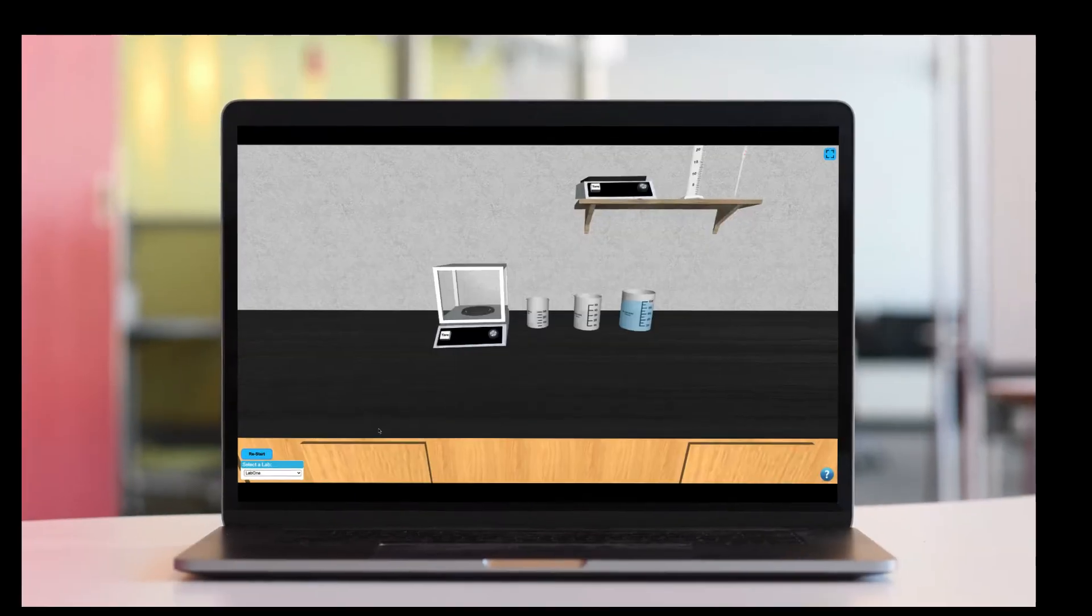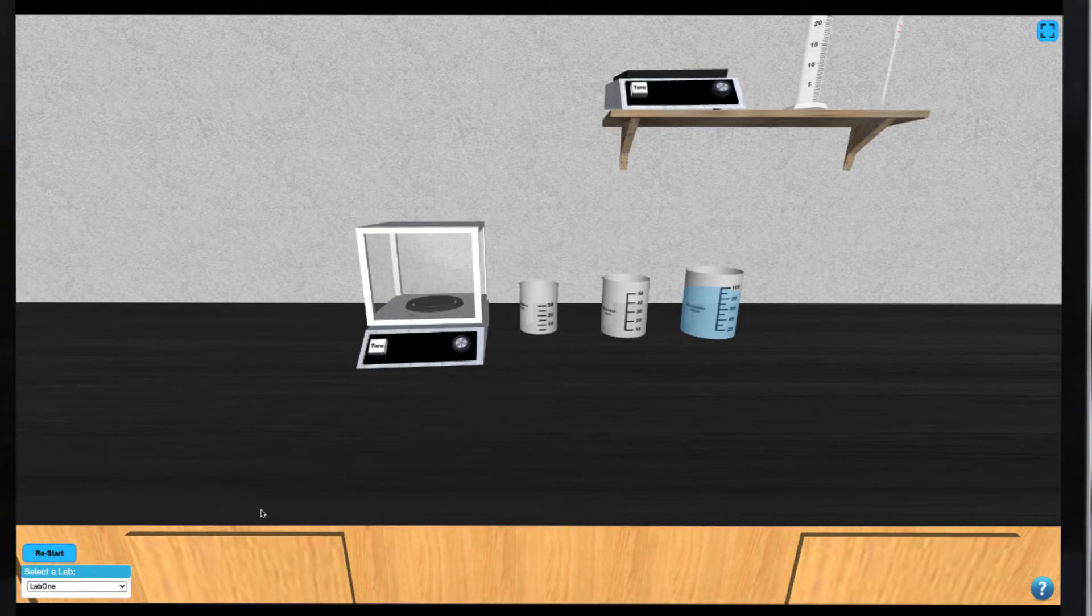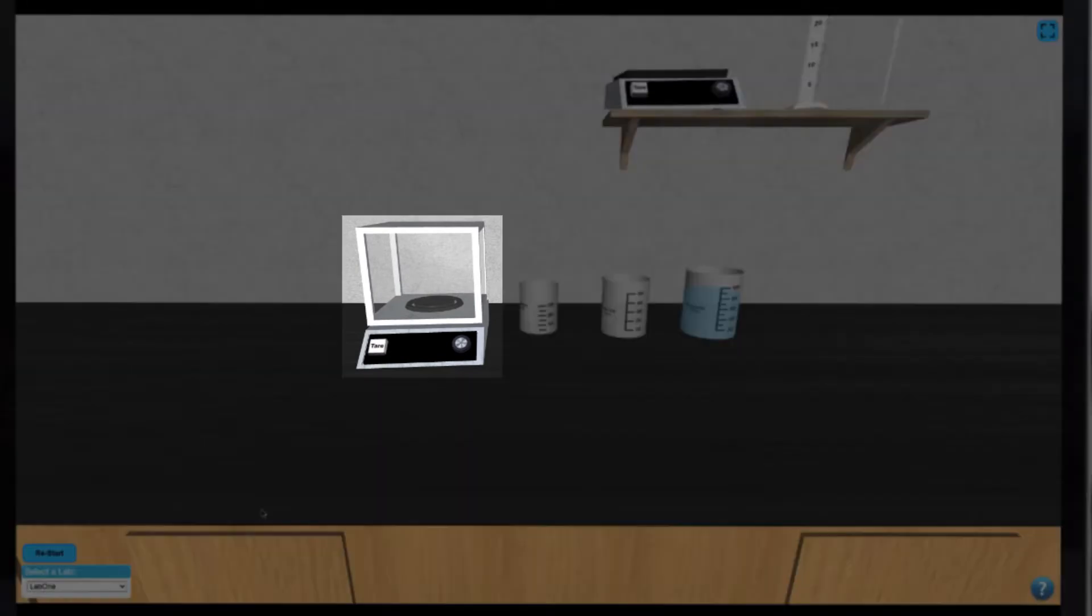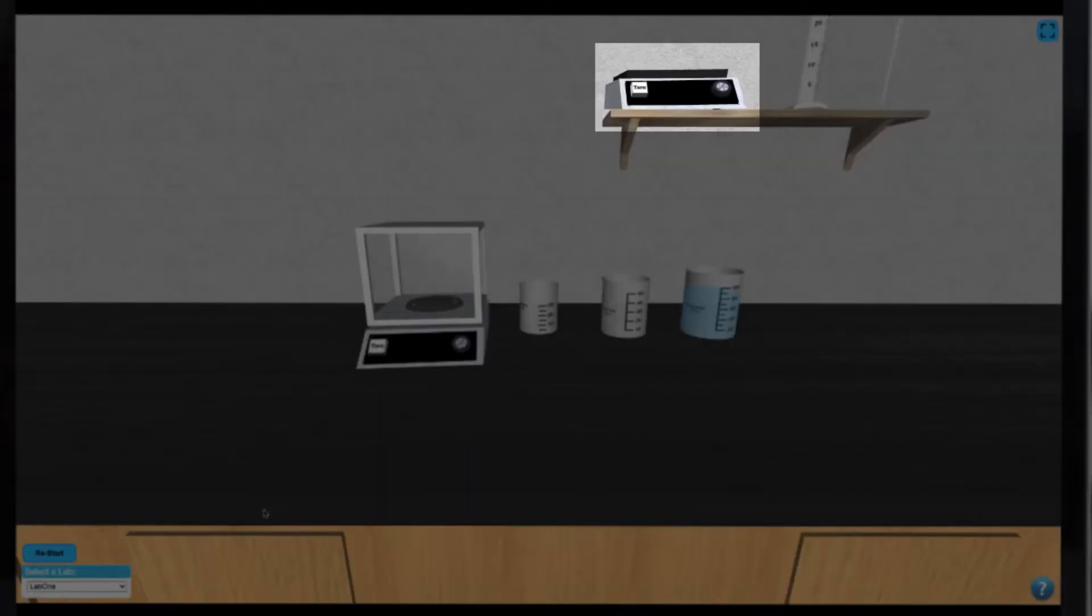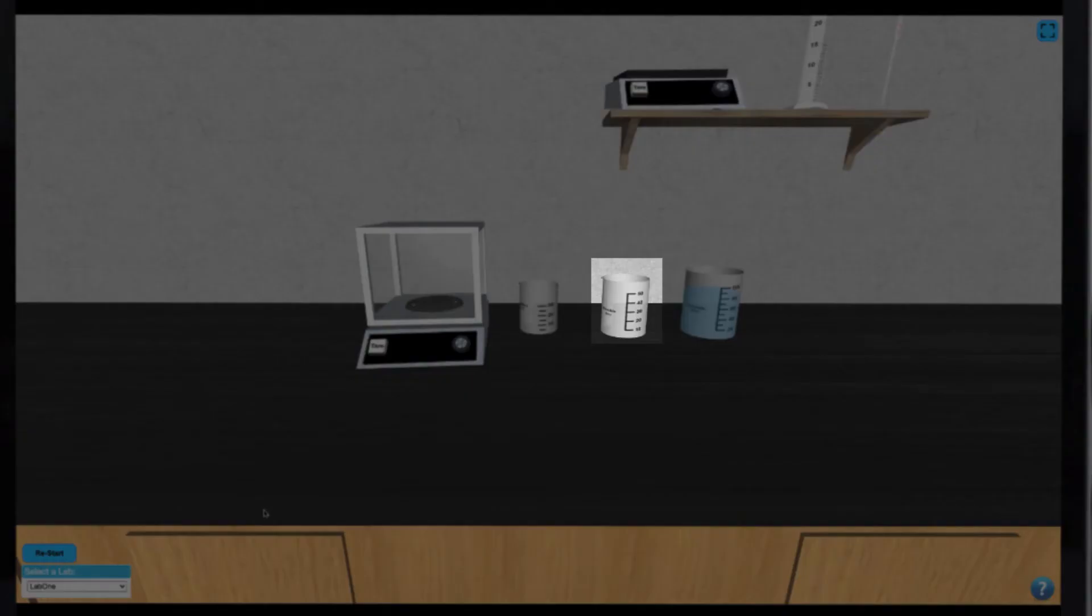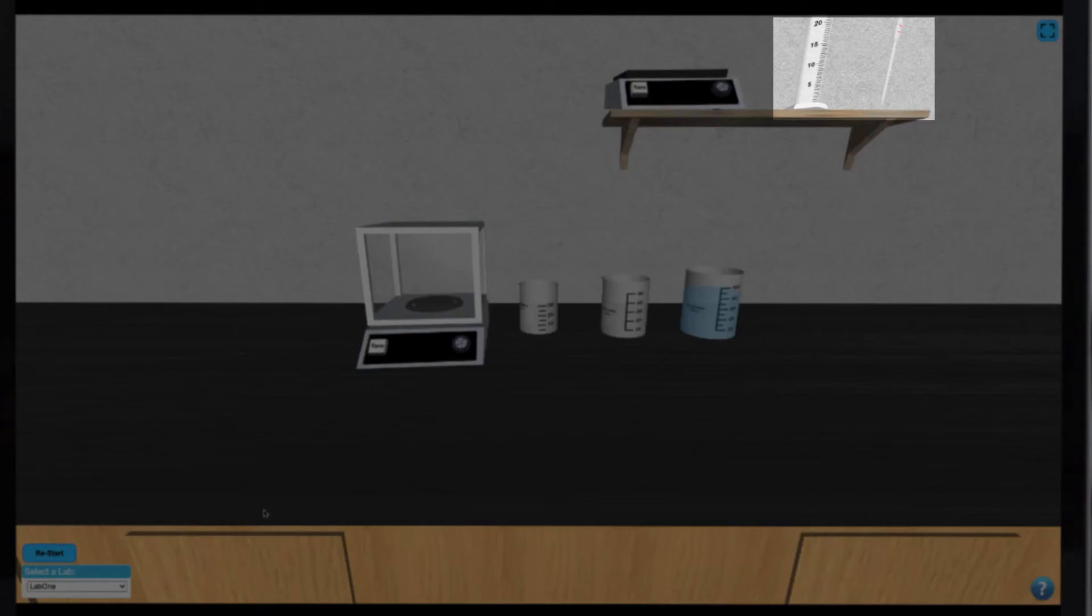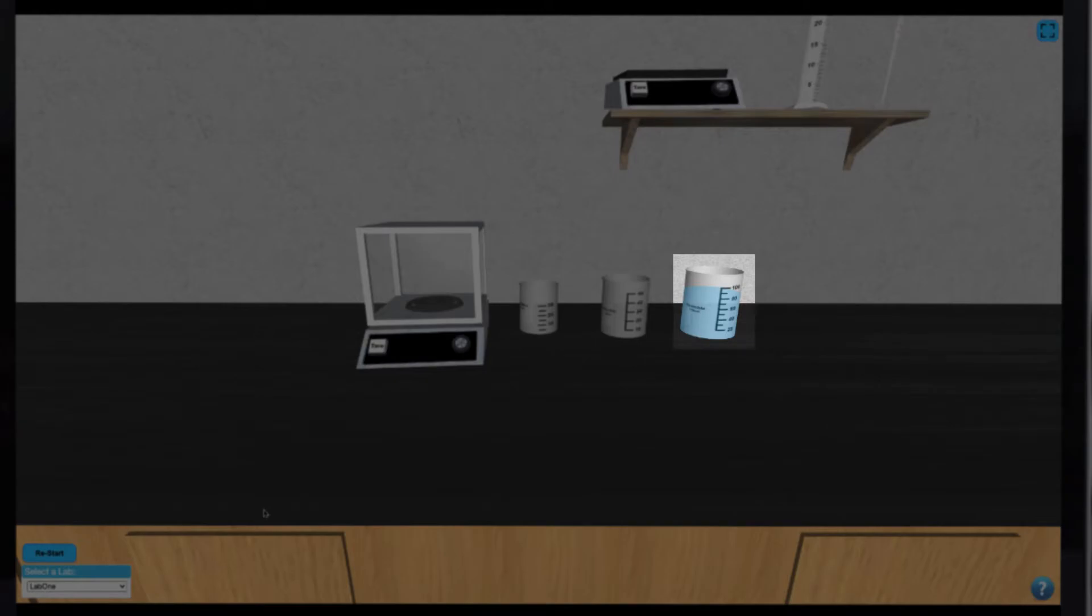In this simulation, you'll explore accuracy and precision in measurement. The equipment available includes two balances, a beaker for weighing your samples, three pieces of glassware used to measure the volume of liquids, and a reservoir of water.